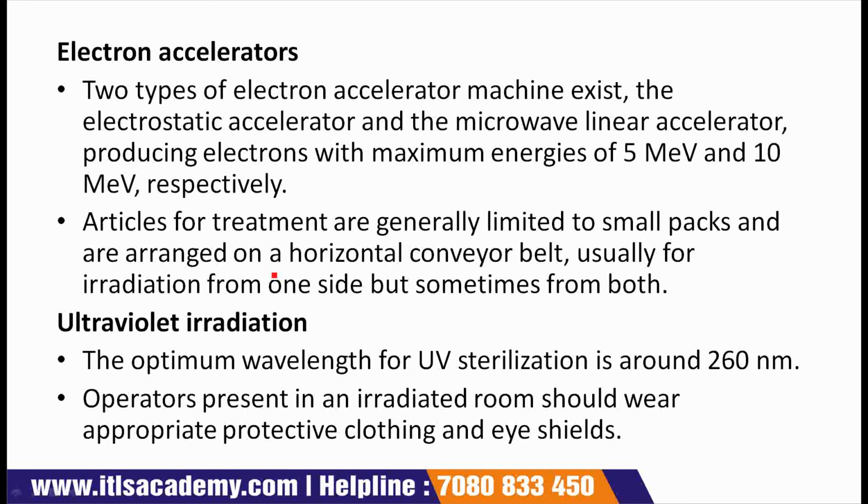Next comes ultraviolet irradiation. The point is, the optimum wavelength for UV sterilization is around 260 nanometer.